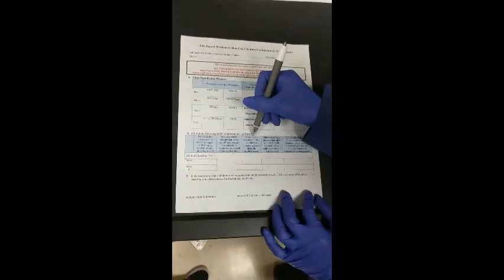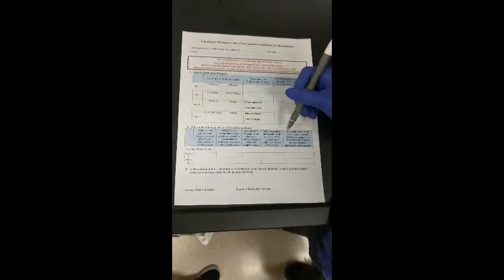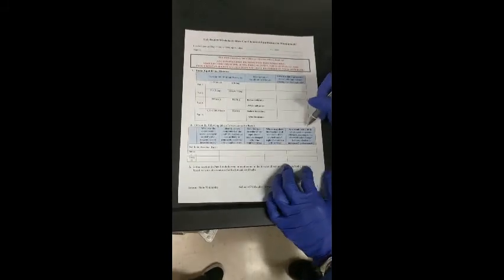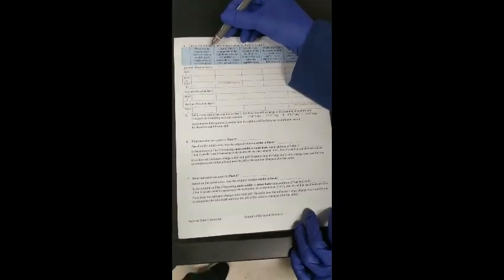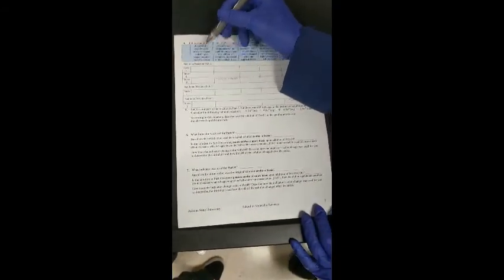In the next column, please describe the color of the equilibrium mixture after applying the experimental step. And then please describe in which direction the equilibrium shifted based on Le Chatelier's principle. And at last, please describe why the shift is brought by the experimental procedure. The second table, on the second page, is similar, but you put chemical species into the solution. So please describe what kind of solution you put into the mixture.